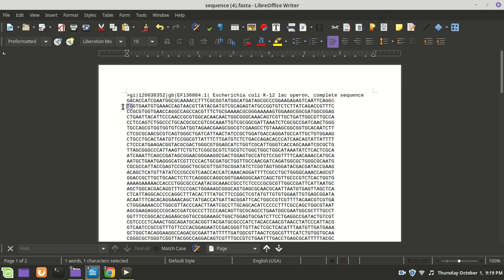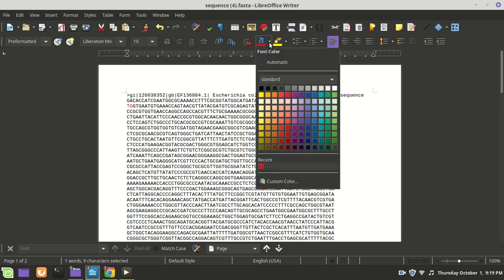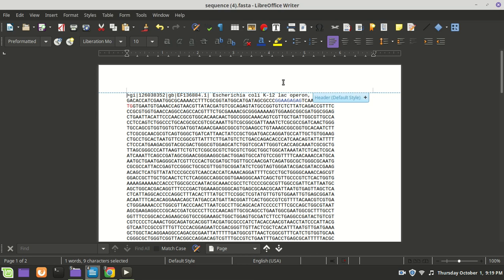It's GTG here, and I showed this in a previous video. And we also decided in that video that probably the Shine-Dalgarno is here. So I'm going to change that to a different color, blue.